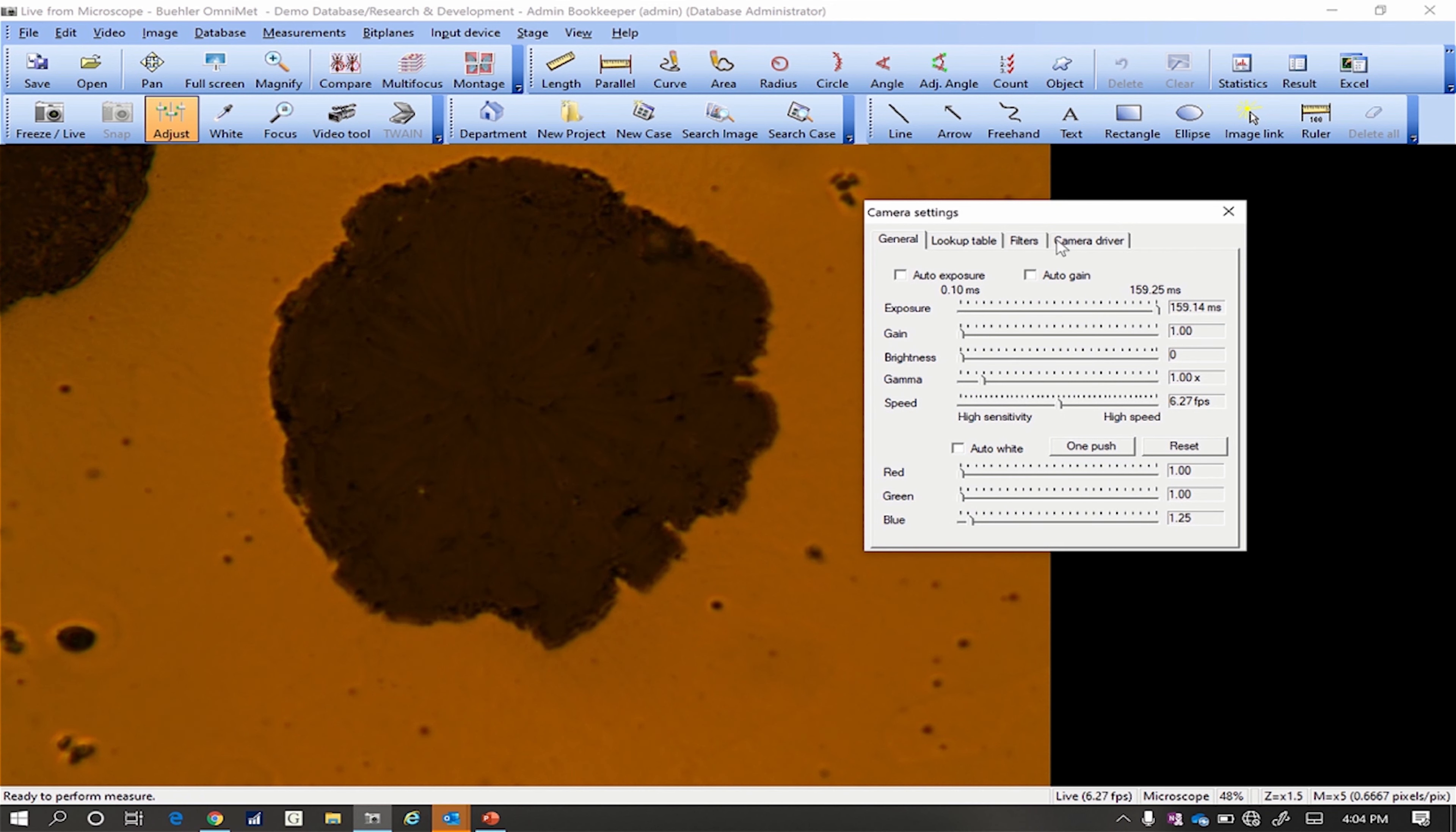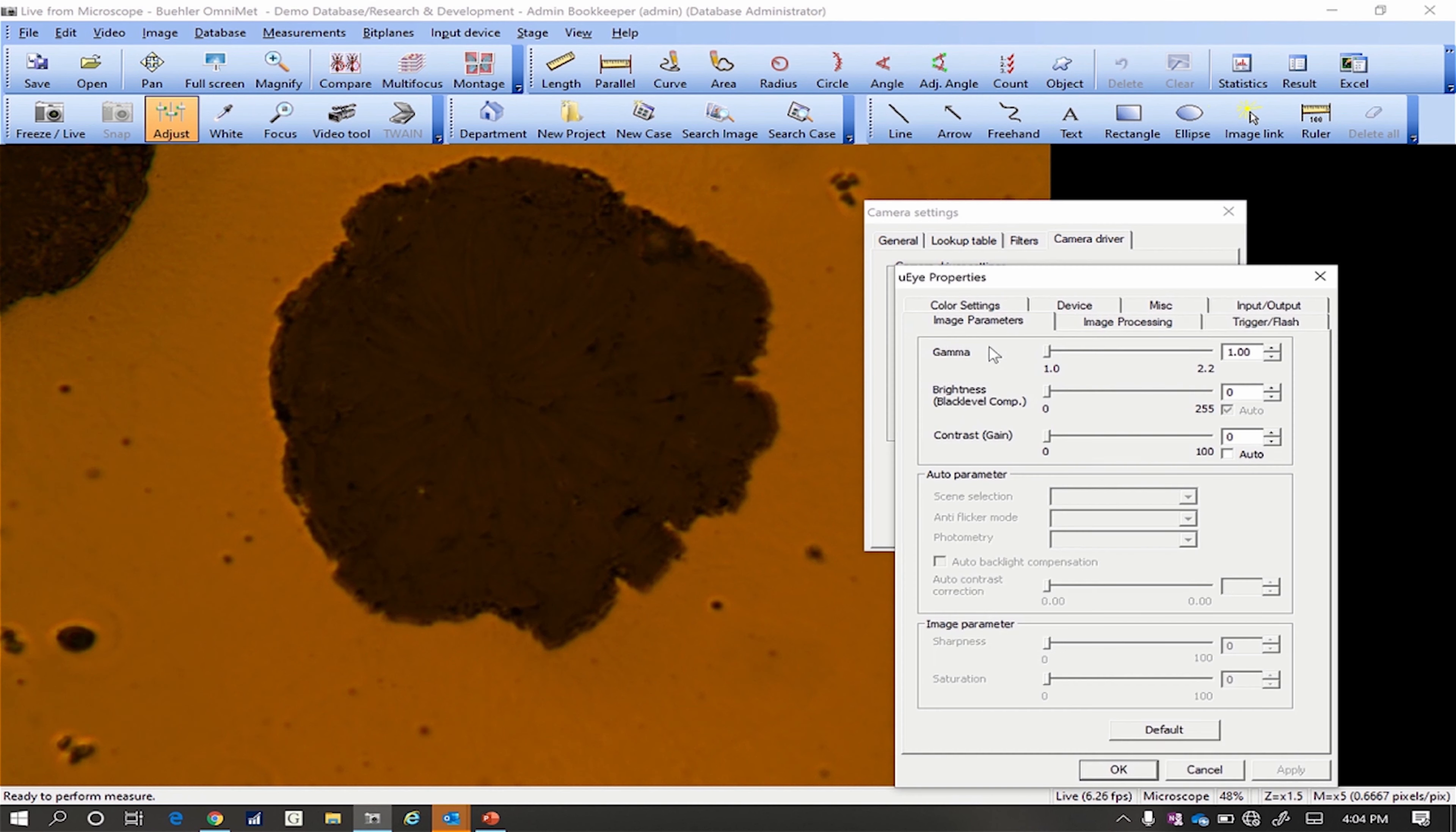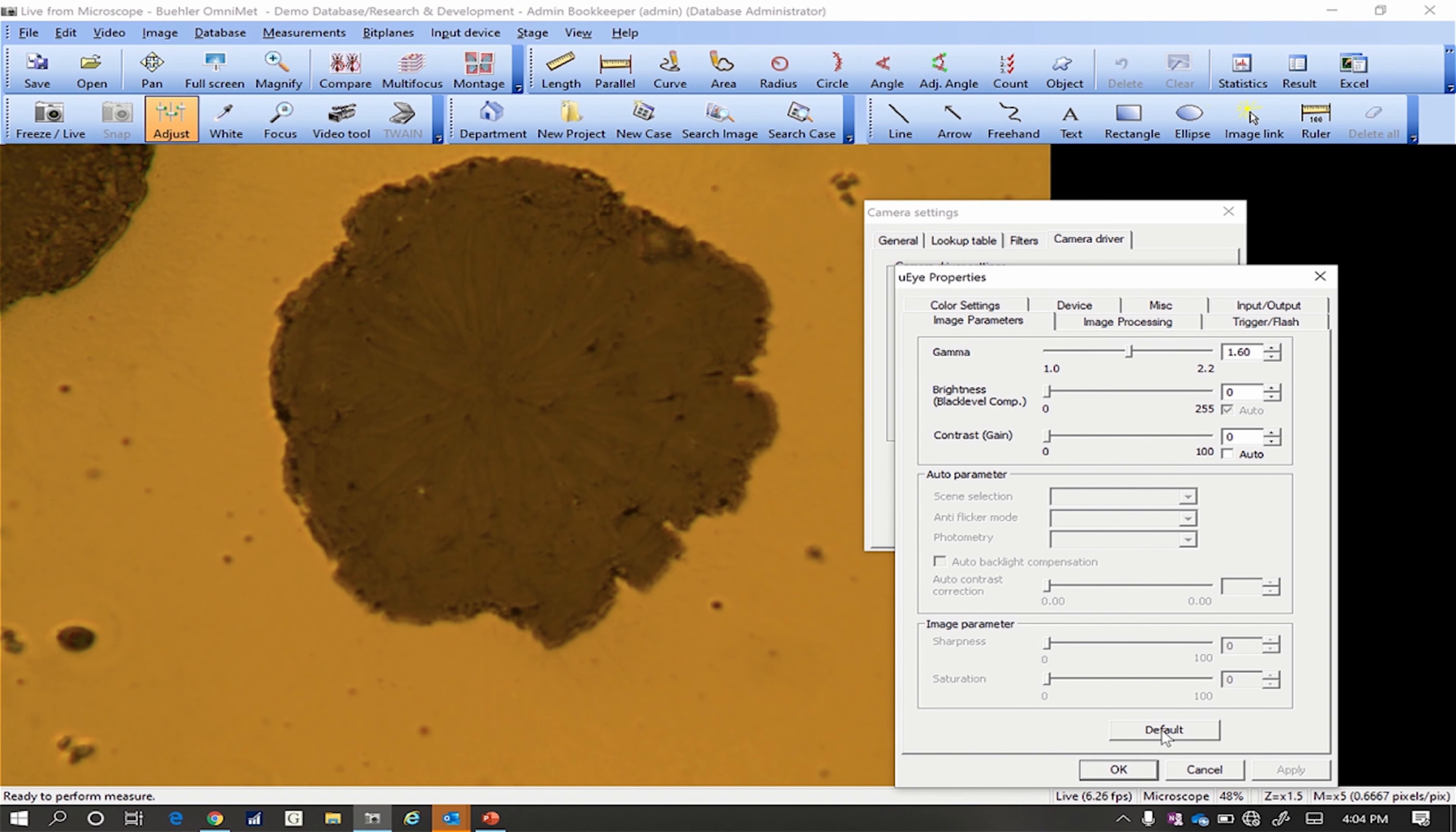Select the Camera Driver tab and then Capture Filter. Click the default button on the Image Parameters, Image Processing, and Color Settings tabs.